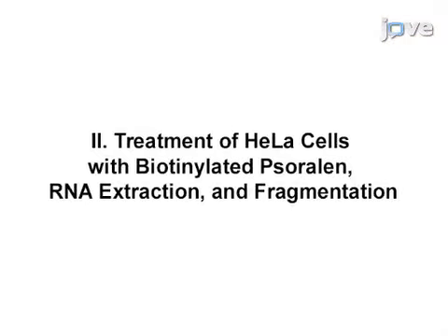Note that the following procedure contains several stopping points. At these times, the experiment can be paused briefly or indefinitely. Details can be found in the accompanying text.